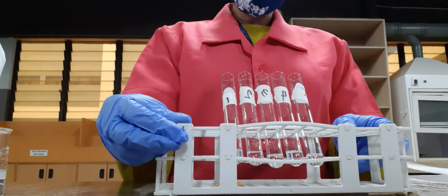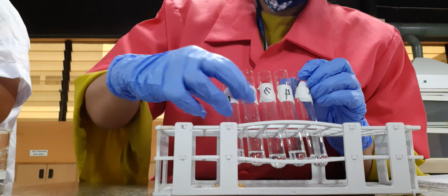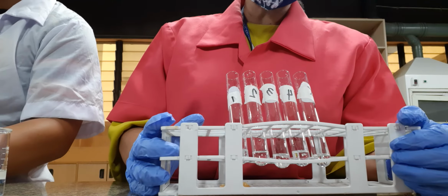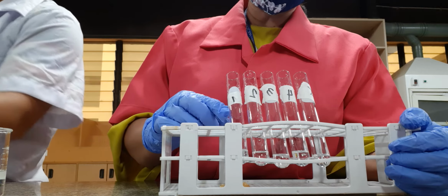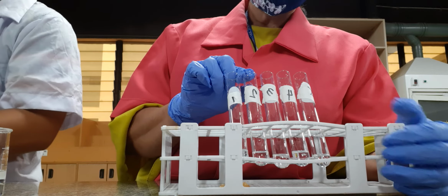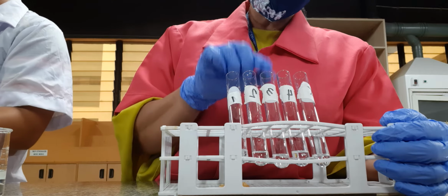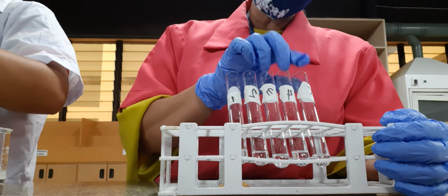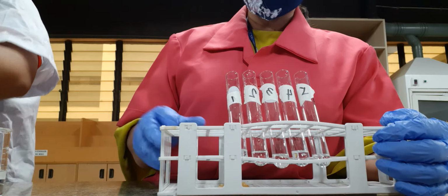Okay, so we have here the labels of our substances, aldehydes and ketones, in order. Our number 1 here is formaldehyde. Number 2 is acetaldehyde. Number 3 is acetone. Number 4 is benzaldehyde. And number 5 is acetophenone.